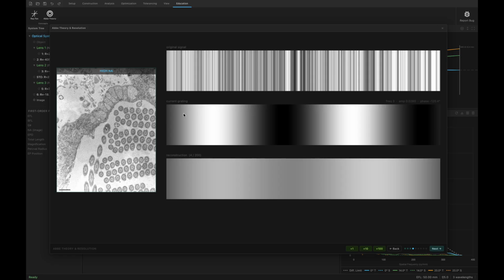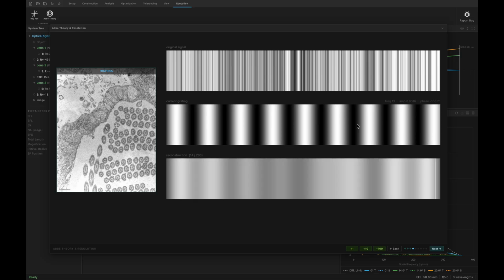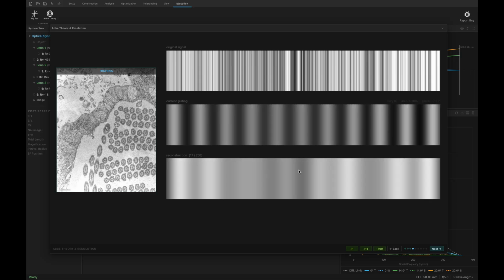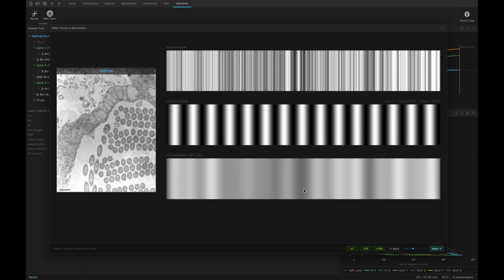And again, this is the exact same sine wave that we were seeing in the previous slide, except represented as an image. So a high point on the sine wave is represented as white, and a low point on the sine wave is represented as dark. And you'll see the exact same thing. As we add more of these sine waves represented as an image, you can start to see this image down here take shape. And you already see that this kind of dark region here is shown here.